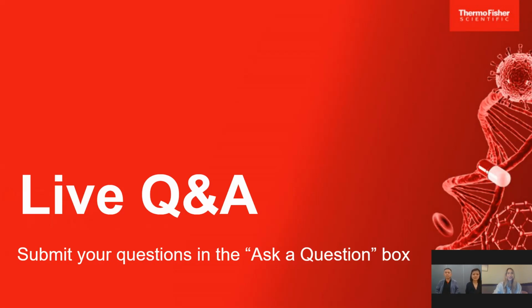Let's get started. Our first question is for you, Anthony. What are the pros and cons of using fluorescent conjugated secondary versus enzyme conjugated secondary antibodies? Thanks, Megan.